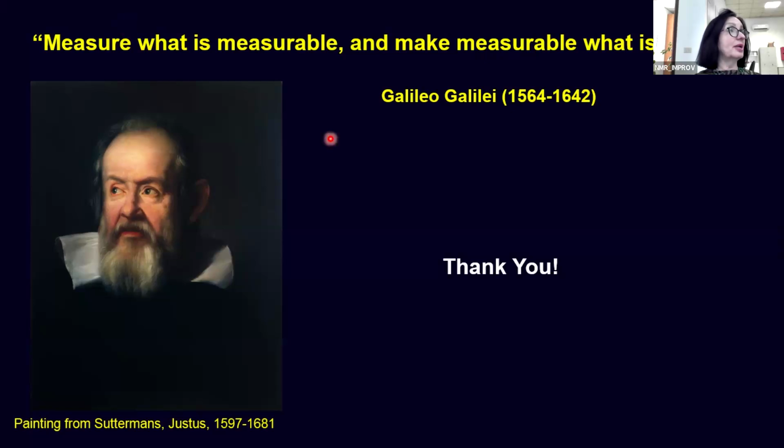when you put it in this way, of course, there are situations when I can validate the model. I understood what you mean by validation: obtaining some parameters and comparing them with the values of such parameters obtained by other methods. Of course, if you have an independent source of information, results obtained in different ways should be consistent. But quite often you do not have an independent source of information, because after all, NMR relaxometry is quite unique.